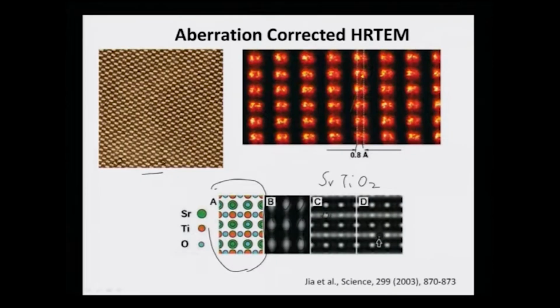Obviously, as I have shown you pictures where you can see even atoms, actually we do not see the atoms, we see the potential of an atom. When an electron interacts with the material and forms a particular image, we see basically the potential of the atom in the imaging plane, we do not see the atoms. But many people write in textbooks and even in lectures that, quote and unquote, we see atoms.